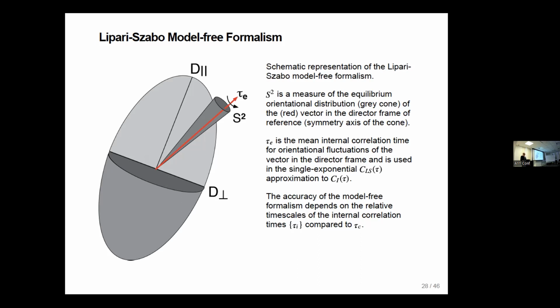The main approach is sample shuttling, moving the sample from high field to low field for the relaxation experiment and back again. And Fabien Ferrage again in Paris has done the most along these lines.